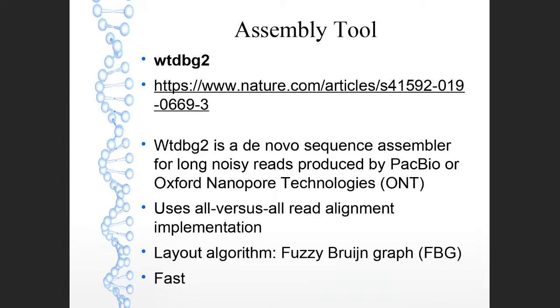It's still a very fast option, so we can actually do some meaningful assembly in this practical, whilst with some fairly chunky data sets. So that said, there will be some points in this practical which do take a little while. Sometimes half an hour to an hour running on our server, with the number of threads specified.